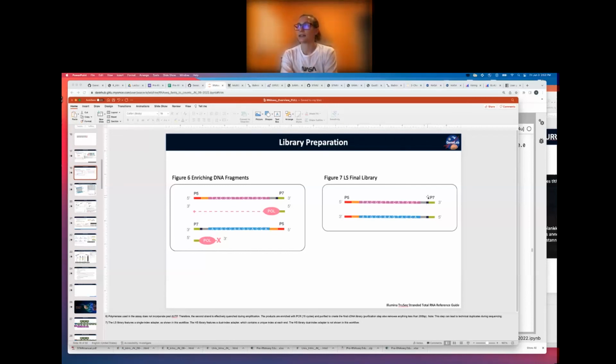That index on, and we have a P5 and a P7 index if we do a dual index, which is what we do at GeneLab. And so it'll sequence into this adapter. The universal adapter is accounting for the sequence of the primer and the sequence of the region that's complementary to the flow cell. Because there's different sequences for your index, you're going to have a chunk of sequence that's 6 base pairs for us, a chunk of sequence that's your index that you could sequence into that isn't going to match up to your adapter sequence.